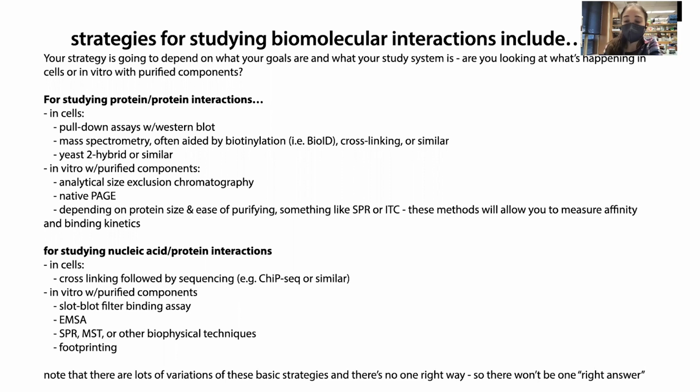Most of the work I do, other than expressing my proteins, is in vitro. And this is most of what I'm going to talk about, but I'll also tell you about some of the techniques you use to study these things inside of cells. A lot of times people will do a combination of both.